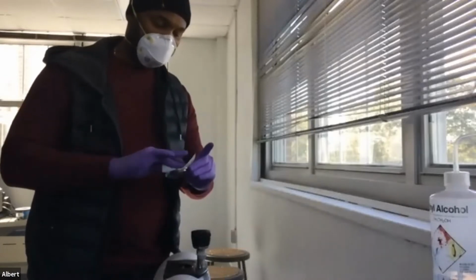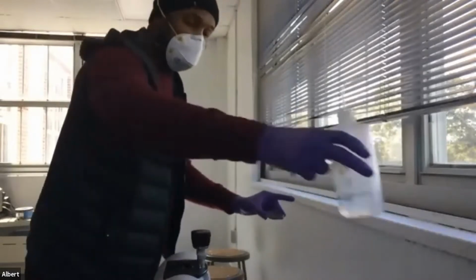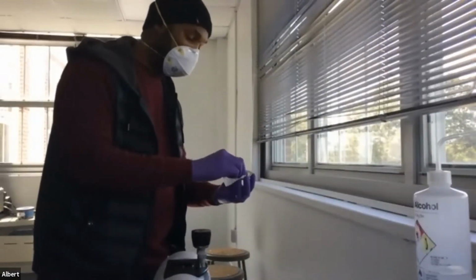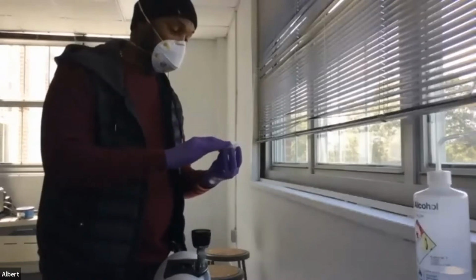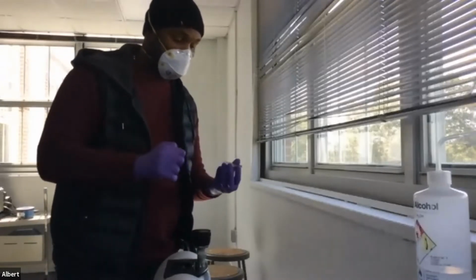All right. And I'm going to hit this with a little ethanol to clean it off. You want to make sure all that solid is off of there, because what you don't want to happen is to dissolve the solid up and have a film or a residue on here for when you're running your next sample. All right, so that's that.